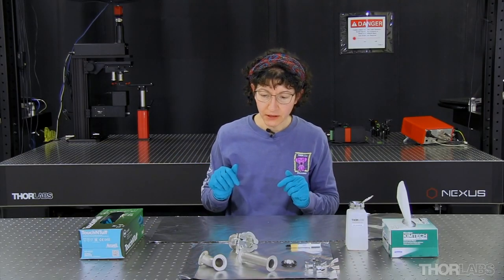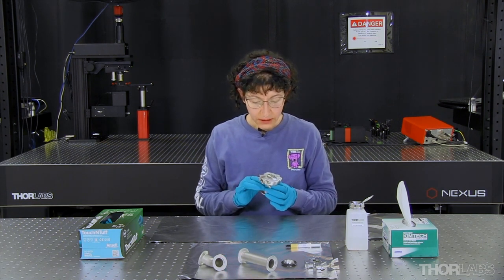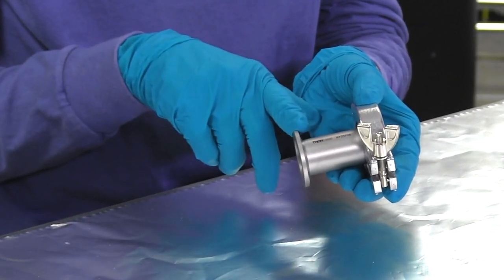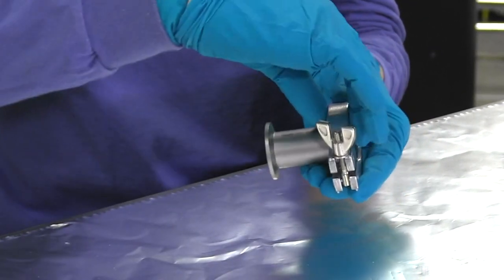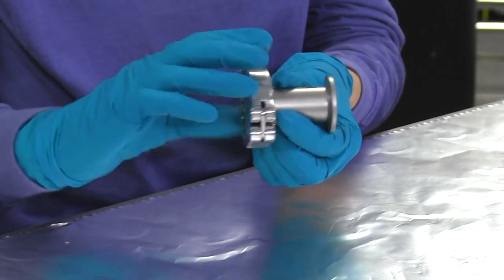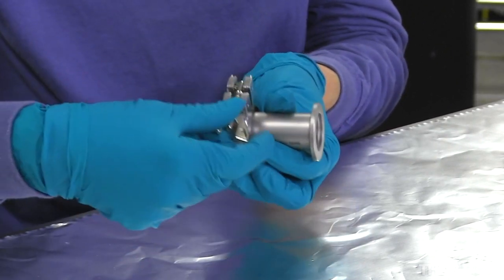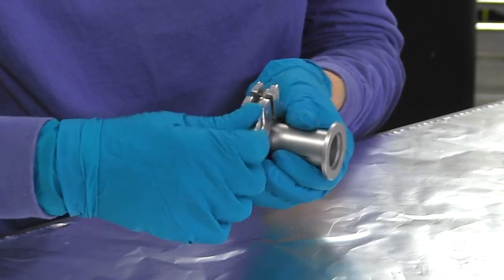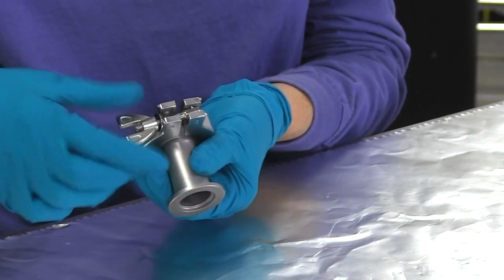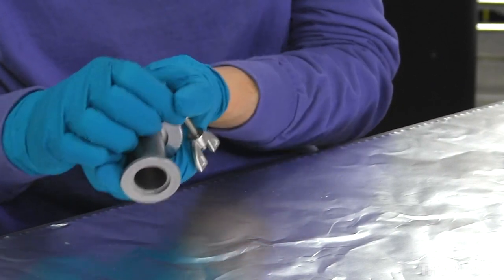Now I'm going to begin working with one of the KF flanged vacuum assemblies. This is a pipe — this is one flange, and the other flange is hidden underneath this clamp. This is a blank; it's being used as an end cap to seal off this end of the pipe. I'm going to release the clamp by unscrewing this wing nut. When I've unscrewed it enough, I can rotate this part out and pry the two parts of the clamp open.